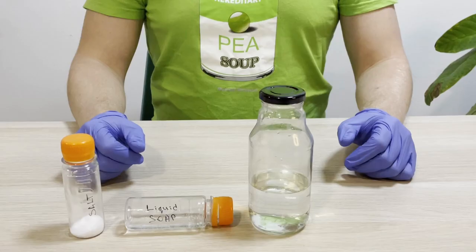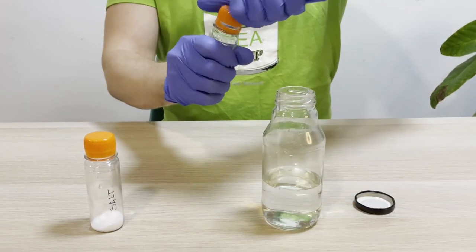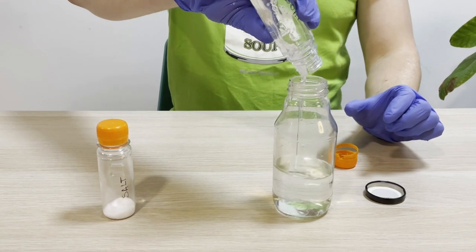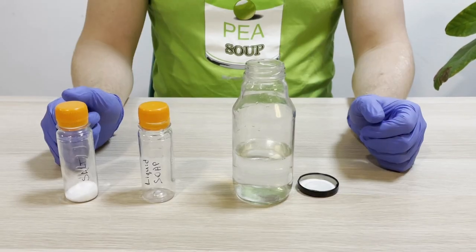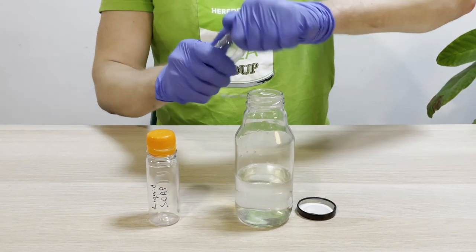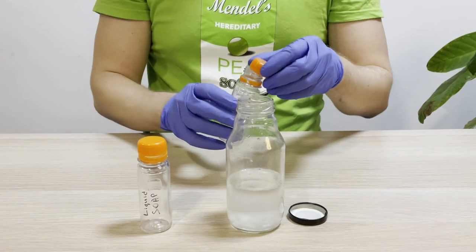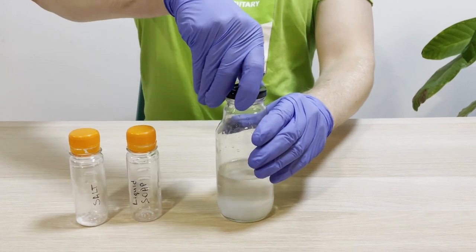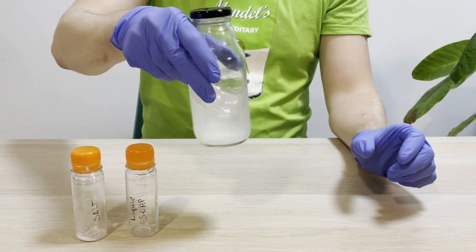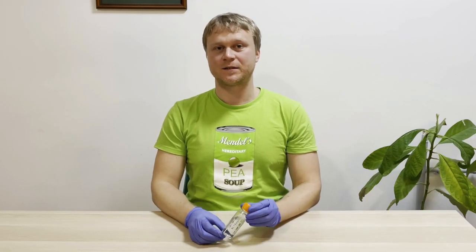Firstly, let's start with the preparation of all necessary solutions. Mix liquid soap with water. Then add a spoon of salt. Mix everything carefully until the salt is dissolved. Put the alcohol in the freezer at least for 20 minutes in order to cool it down.